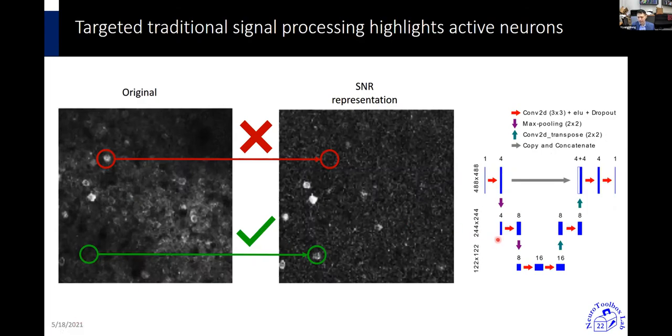But one of the benefits that we see compared to our previous implementation and probably other implementations is that the number of elements in this network is about 5,000. The number of weights in our previous was 2.5 orders of magnitude higher than that. So it took in our previous iteration about a week to train it. Now it takes about 30 to 60 minutes. So as long as you have a decent number of training elements, you can train this very quickly within the same day and get a reasonable output, we believe. Great, thank you.